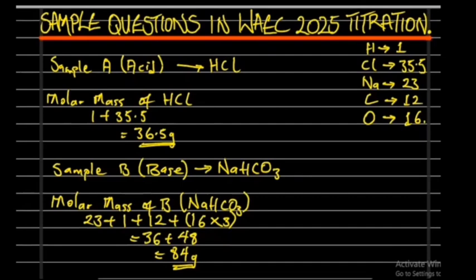So now that we have talked about this, we have taught ourselves how to calculate the molar mass of the substances. Let us now quickly look at the reaction proper. Let's look at the equation for the reaction.